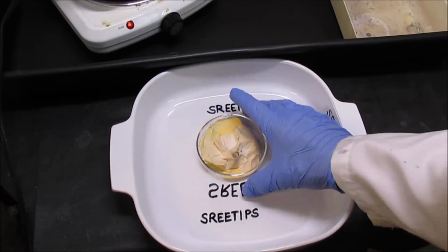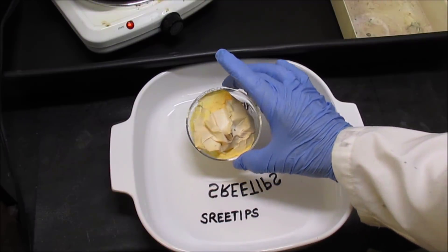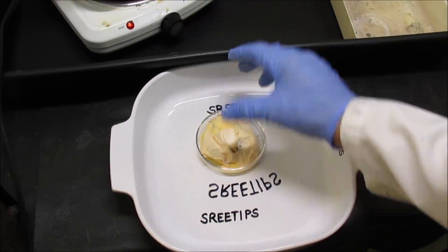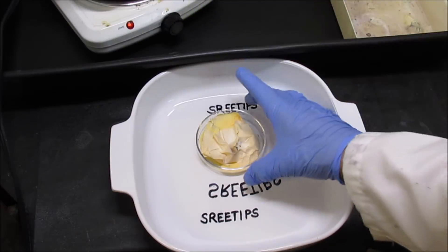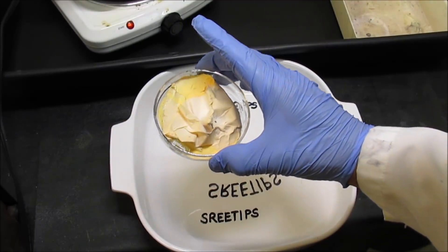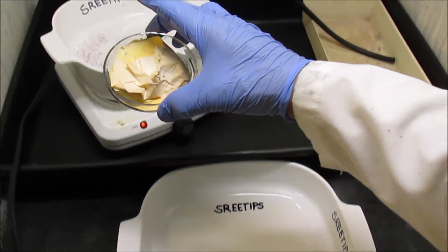Today what we're going to do is I have some pure palladium precipitate from a previous video that I had left over here. It was in a filter paper, and what I'm going to do is turn the heat on and burn off all the ammonium chloride and burn it into palladium sponge — pure palladium sponge.